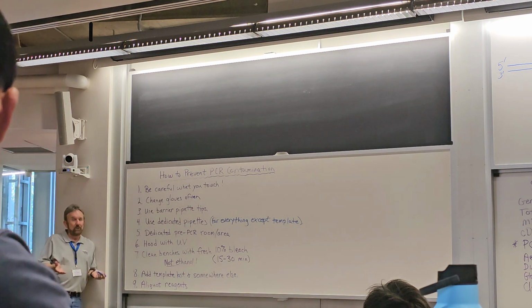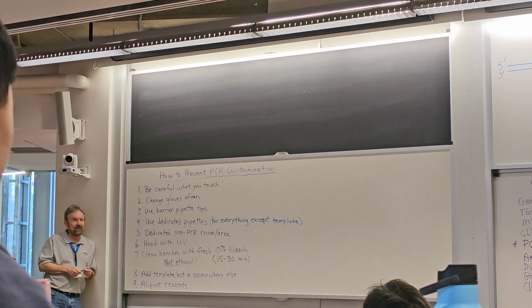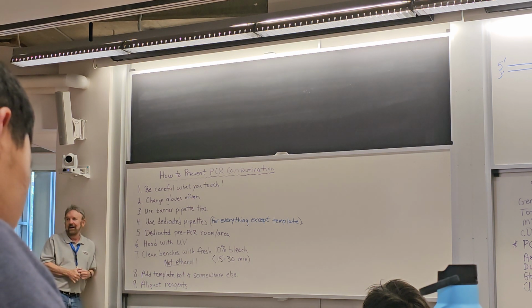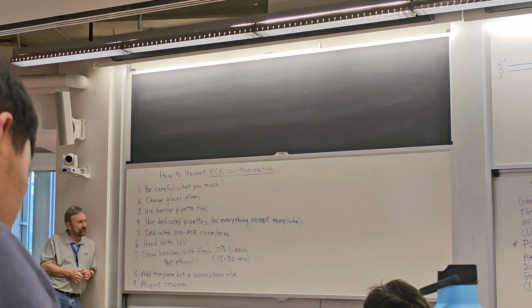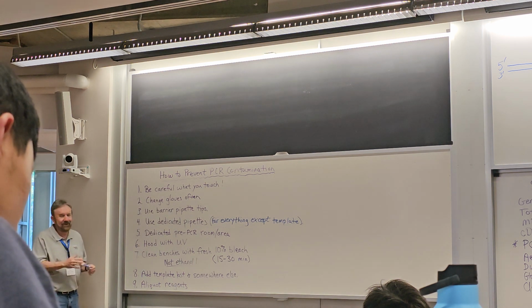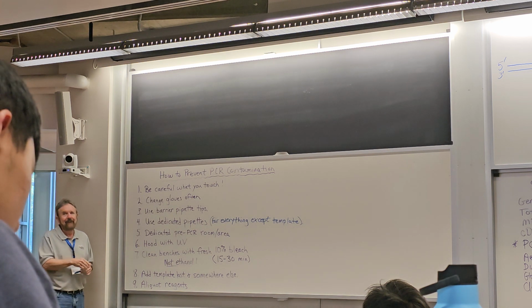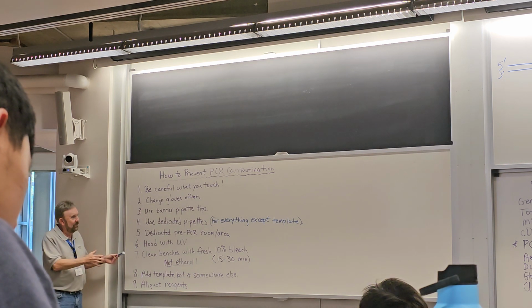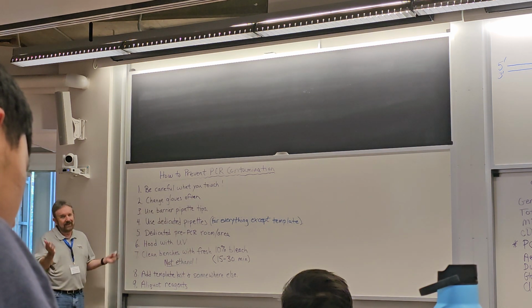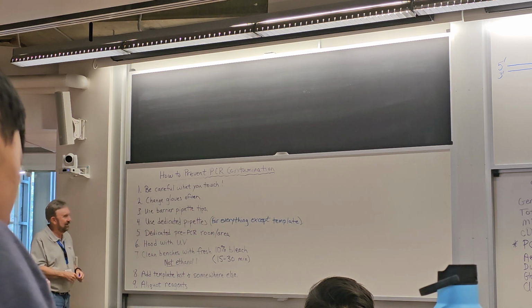So what you want to do is go in and spray down your area and then go away and have a cup of coffee and then go back, and then you're ready to go. So a little patience goes a long way. I would, you know, hate to make waves, right? But that's really true here. If you're in too big a hurry and you rush ahead and you don't follow all the rules, then your experiment doesn't work and then you've wasted a bunch of time.